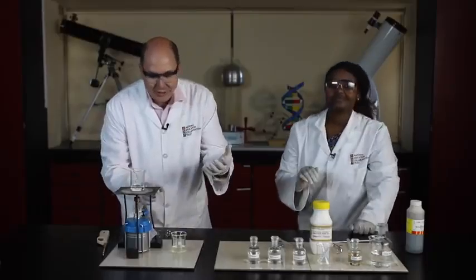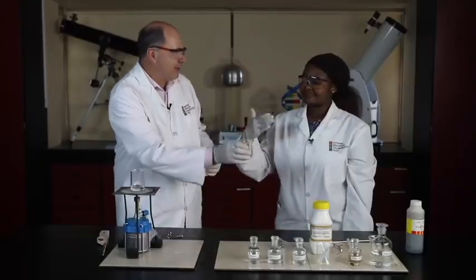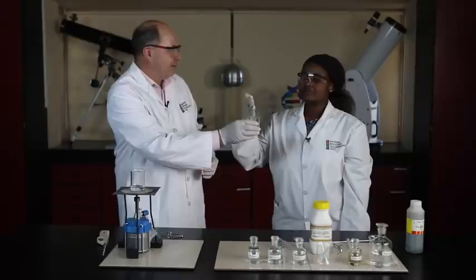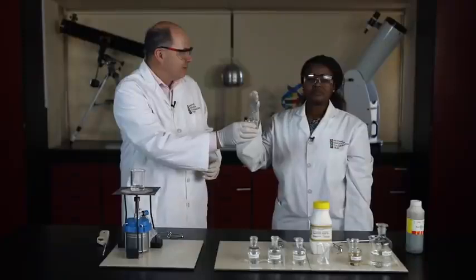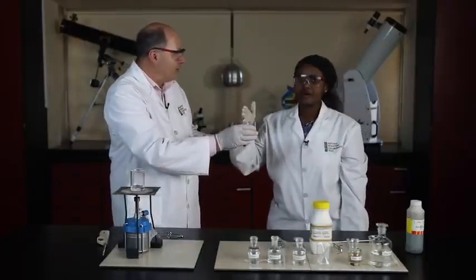No, Joyce, there's no need to let it stand for a short while. I can smell something. Wow. Have a waft. This ester has a very distinctive smell. You know what it reminds me of? Athletes' change room.